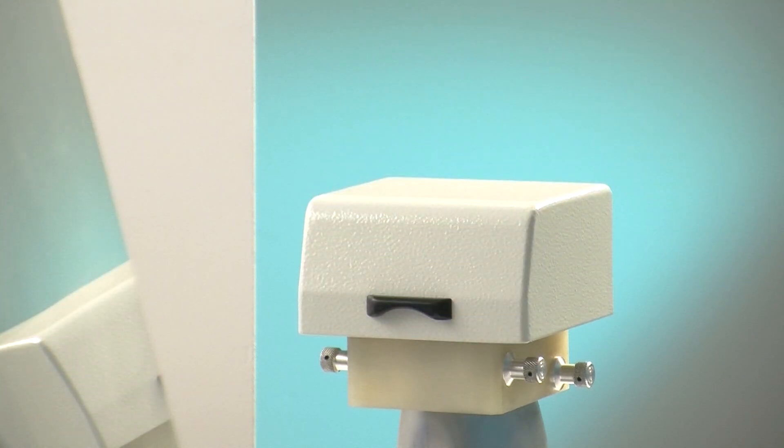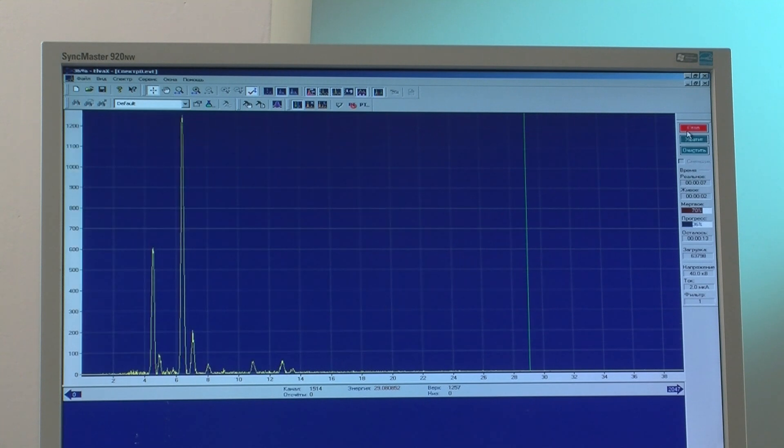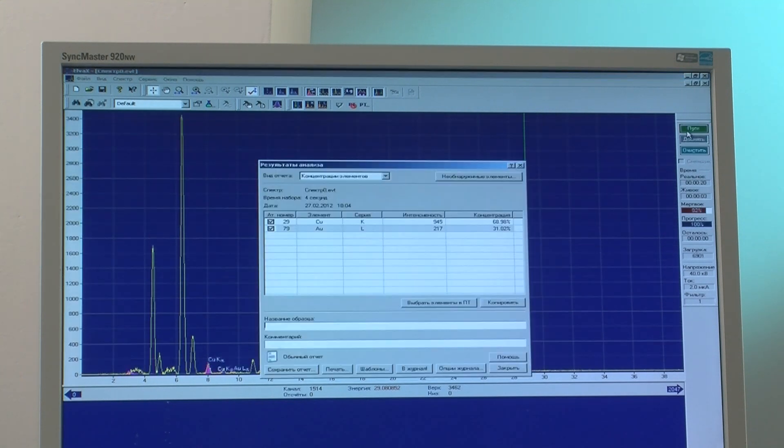Due to the use of a high-resolution SDD detector, Elvax Prospector can detect light elements starting from magnesium with superior accuracy and limits of detection.